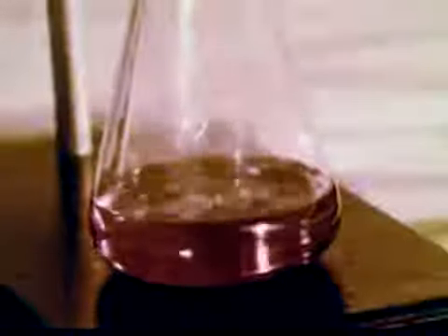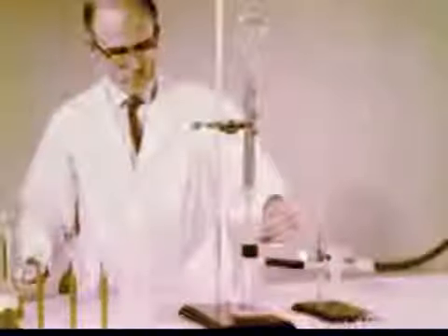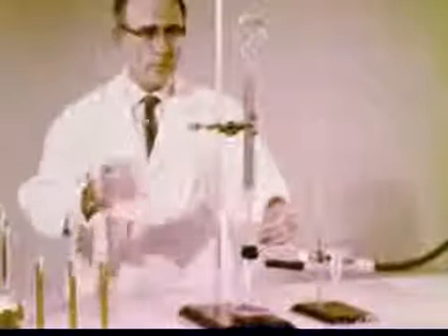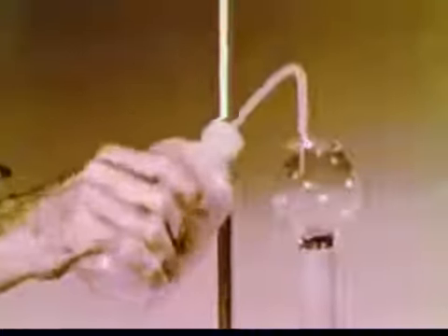Just as before, the vanadium changes to the violet form. The apparatus is washed through with the distilled water to be sure that all of the 5/1000th mole of vanadium is removed.